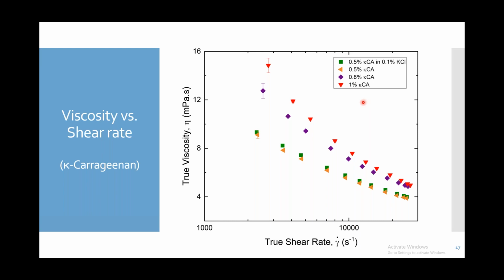Besides this, it is able to undergo a quick gelation or cross-linking process after printing. It shows thermo-reversible gelation, and it can also be ionically cross-linked in the presence of positive ions. So Carrageenan shows interesting properties that I think make it a good candidate for bioink applications. With this background in mind, I'm now going to share with you some data I've collected for this hydrogel.